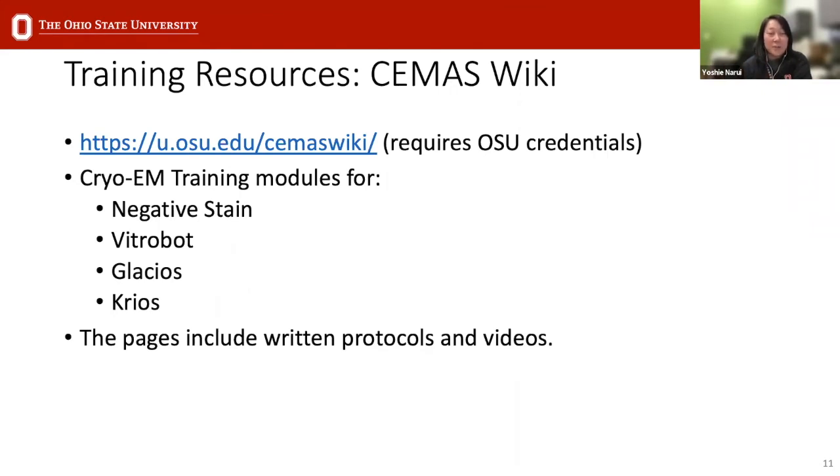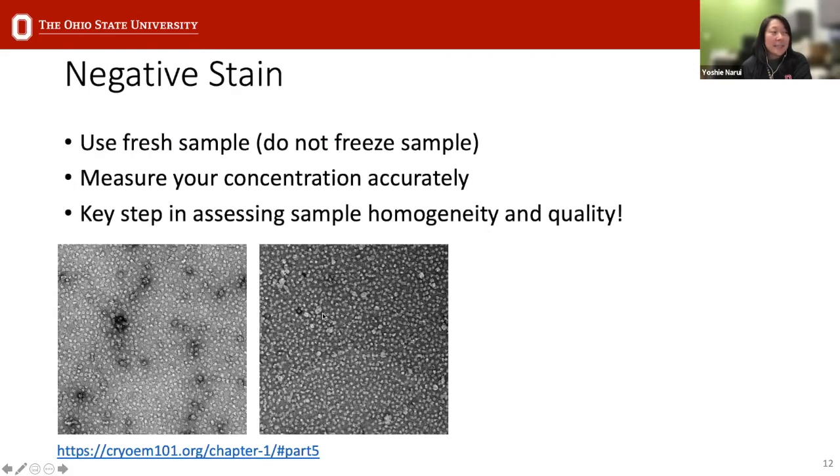It'll make things go much smoother. So you'll be prepared if you preview these videos and the documentation before you get here. Okay, so for negative stain, like I said, we do have videos about how to do negative stain, more instructional, with specific protocols on how to do this.